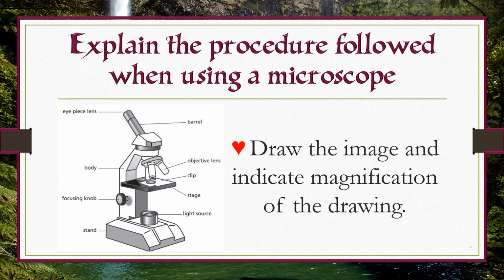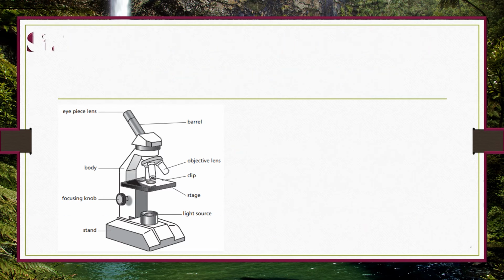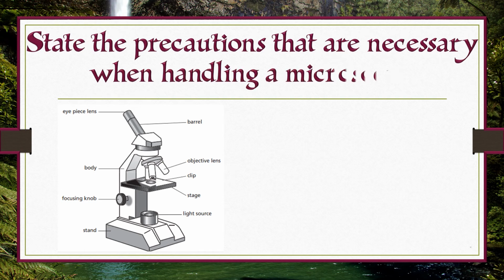Draw the image and indicate magnification of the drawing. State the precautions that are necessary when handling a microscope.